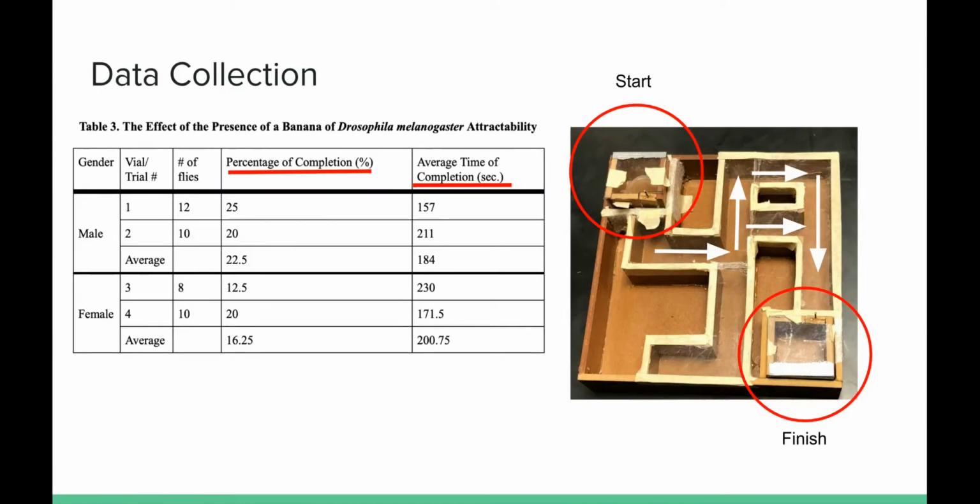As for data collection, for each trial, time was started once the entrance box was opened. Time was recorded each time a fly reached the food source. The data was recorded in the appropriate area on our data sheet.